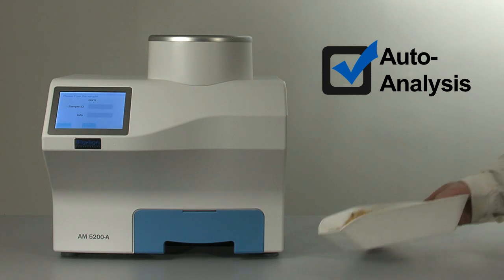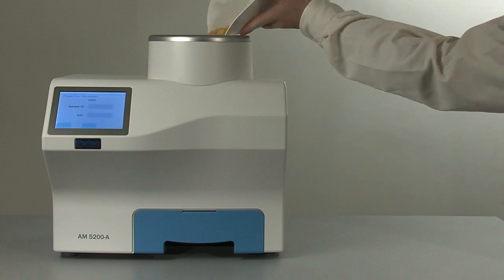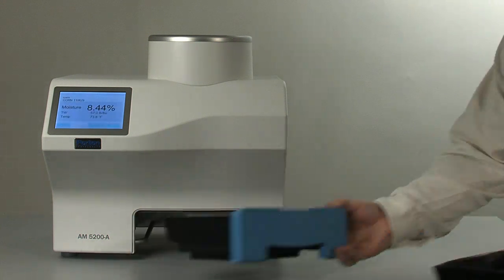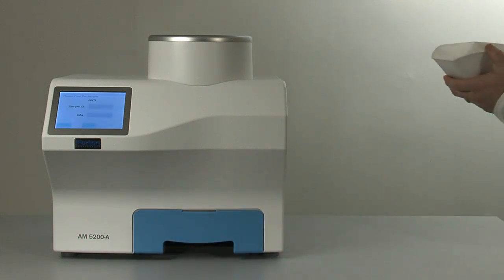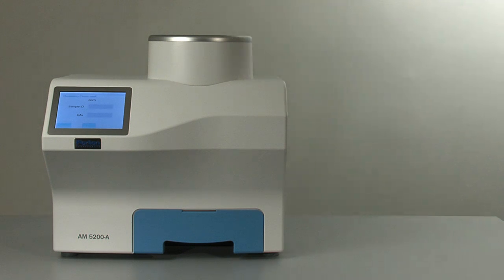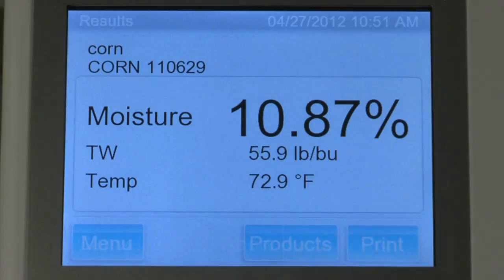During certain times of the year, a typical elevator might receive hundreds of truckloads of the same type of grain every day. The auto-analysis feature of the AM5200A allows you to select the grain type once, and then simply pour in each new sample for analysis. The operator never needs to touch the instrument again until a different type of grain comes across the scale — a great time-saver.